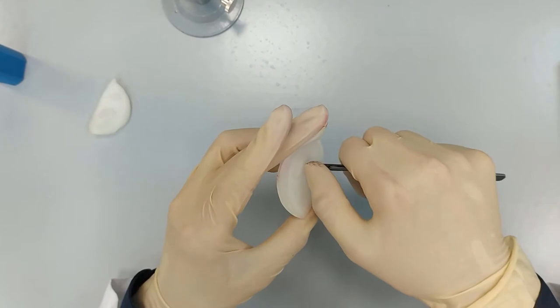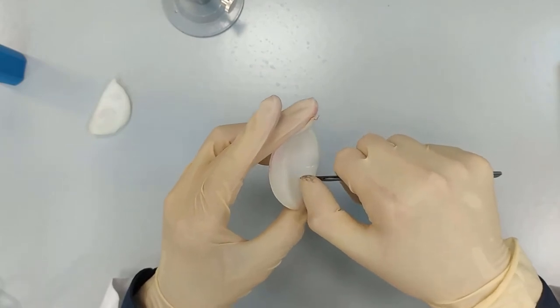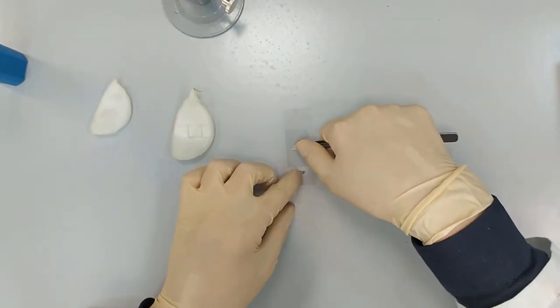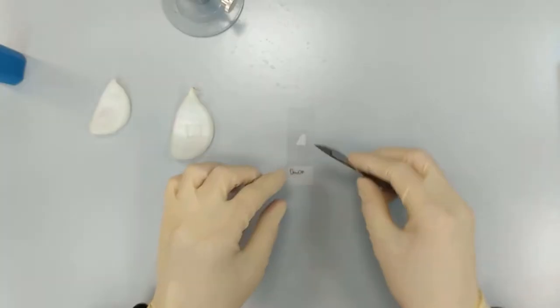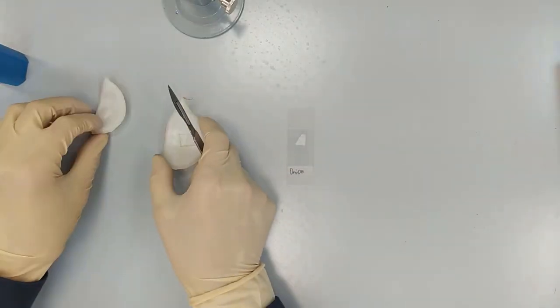So now you have your onion cells on your slide. Then you add methylene blue.